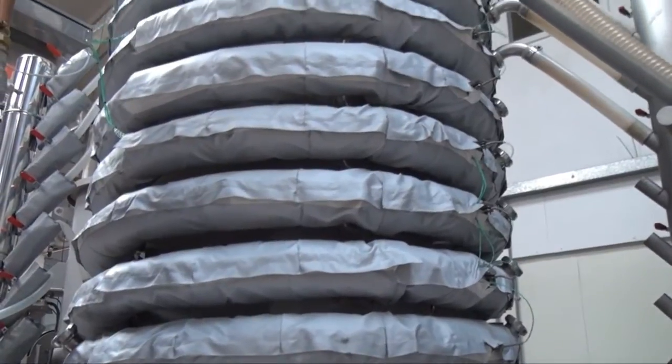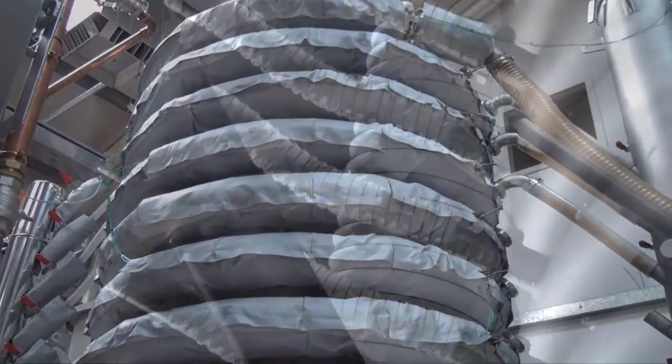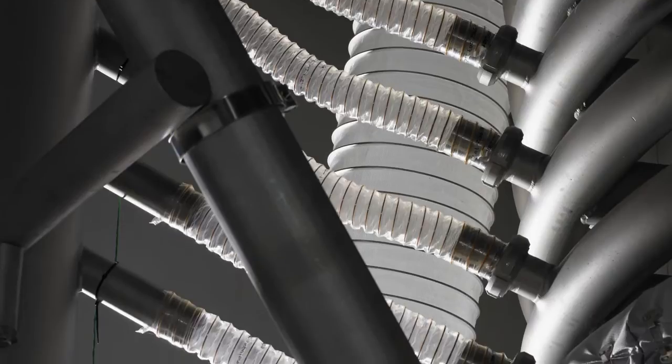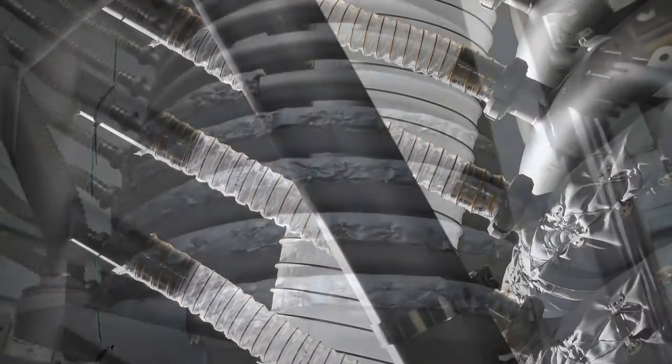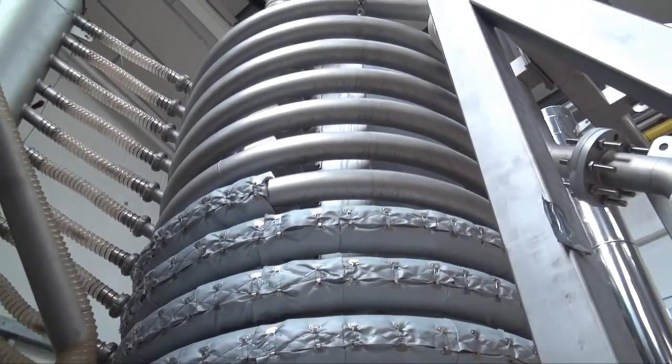Depending on the product, the process requires a drying or cooling step to lower the product's water activity to a level suitable for storage. So, as the product leaves the pasteurizer, it is passed through the drying spiral, again via vibrations, where cool filtered air is blown onto the product to dry and cool it.